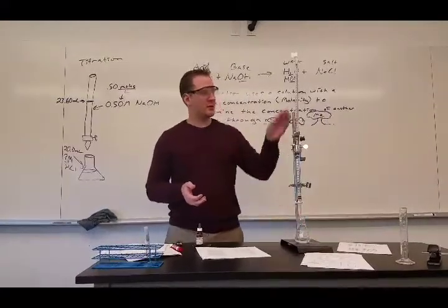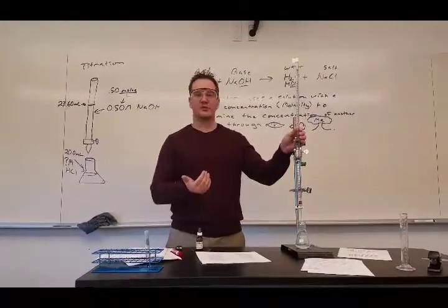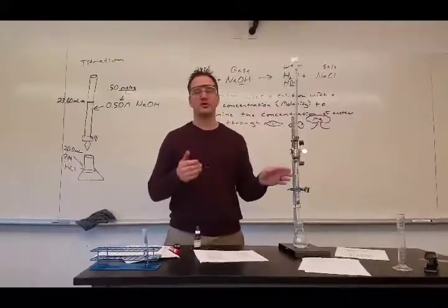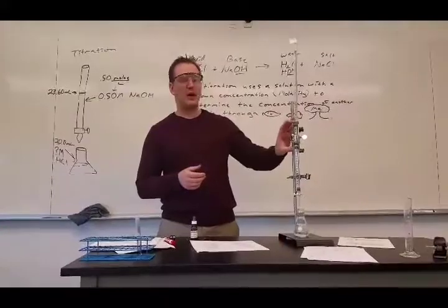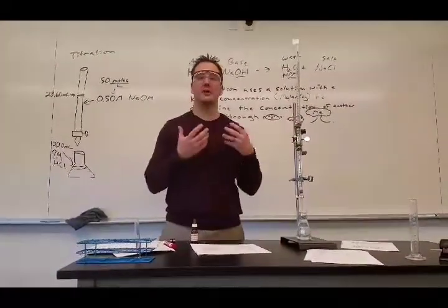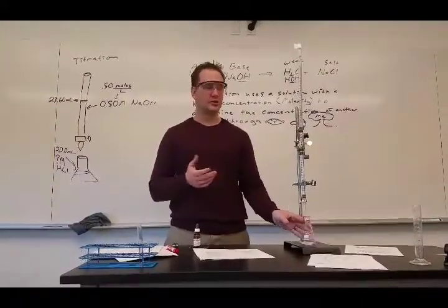This right here in this burette, which is basically a graduated container where you can measure the volume dispensed, has a sodium hydroxide solution in it with a concentration of 0.5 moles per liter. So if I know how much of this I add and I know the concentration, I can figure out how many moles of the sodium hydroxide I had to add to this solution to neutralize it.